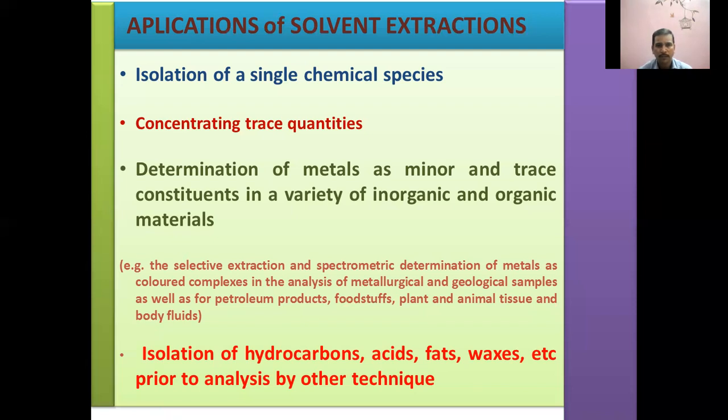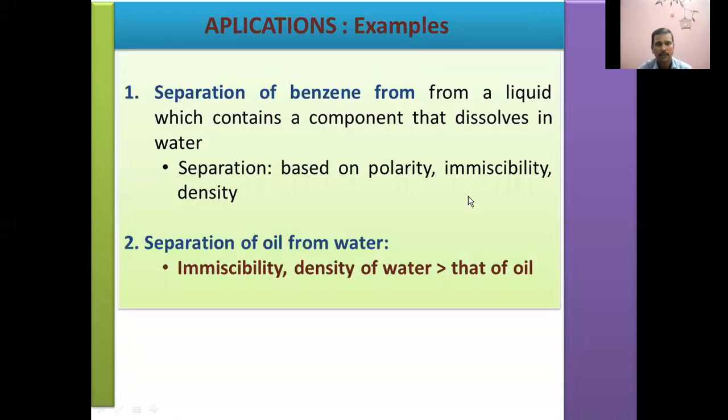It is also used to determine metal concentrations by forming complexes with a suitable ligand, extracting that metal complex into the organic phase and measuring the absorbance of that colored species by spectrophotometry, and even isolation of single chemical components such as in hydrocarbons, waxes, acids, fats, etc. So all these are important applications of liquid extraction. Some examples I am going to present here.